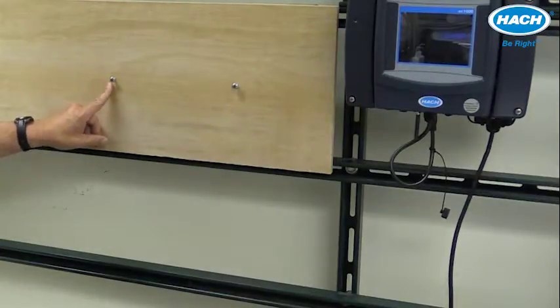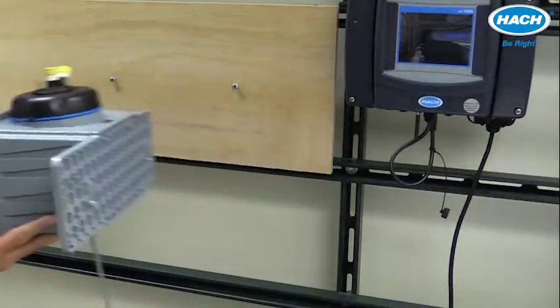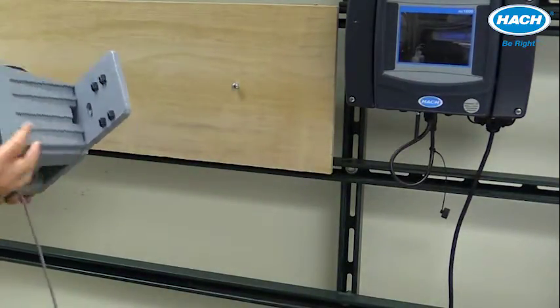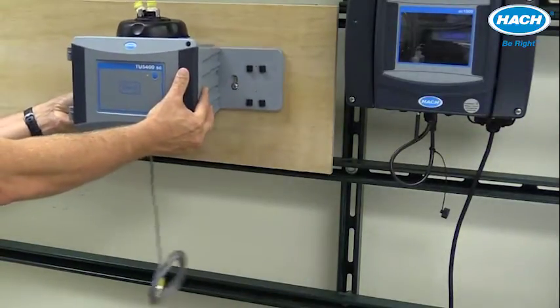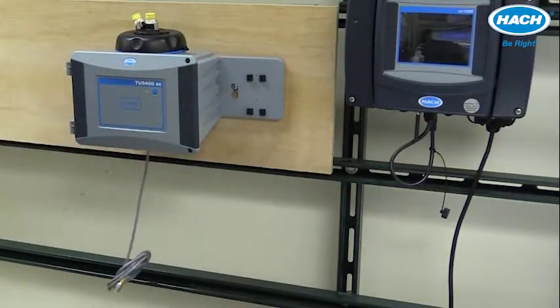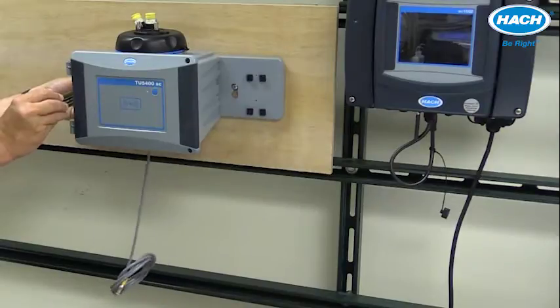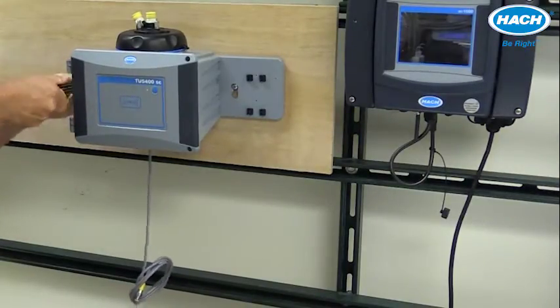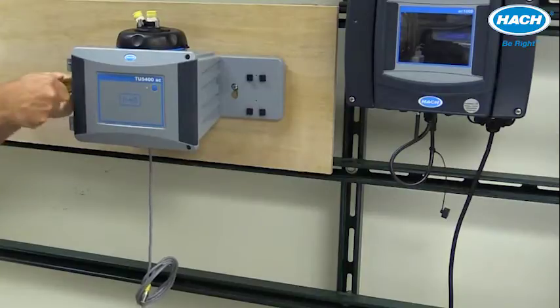The process instrument's mounting bracket will simply slip over the mounting bolts. Using a screwdriver, tighten them to make sure that the bracket and the instrument are firmly attached to the vertical surface.